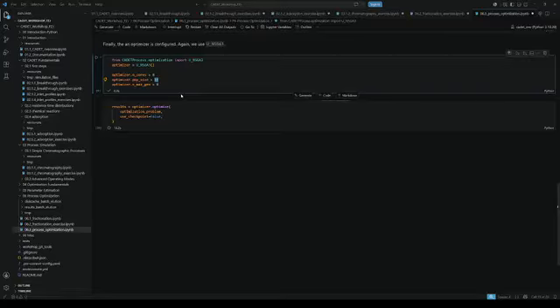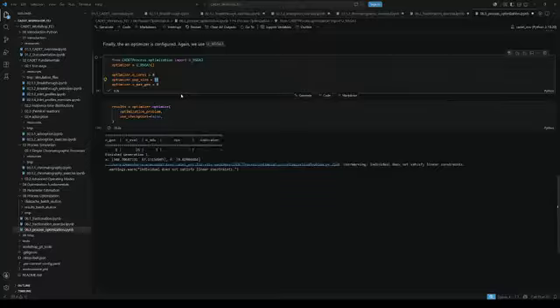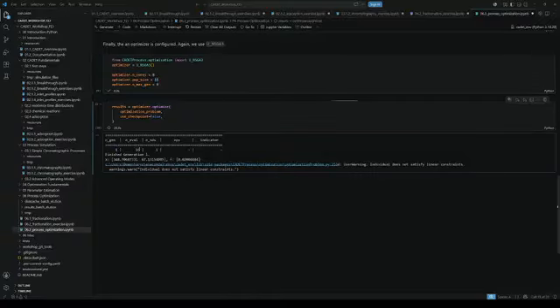So we have to wait a little until we get the first results from our experiment. All right, so here we get the first result from the first generation. We tried 16 different combinations of these parameters, and we found out that the best parameter pair would be like a total process time of 350 seconds.